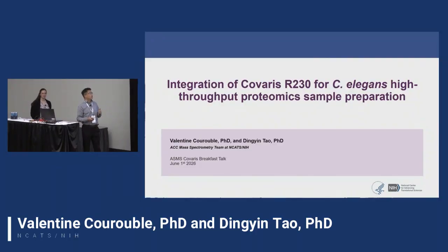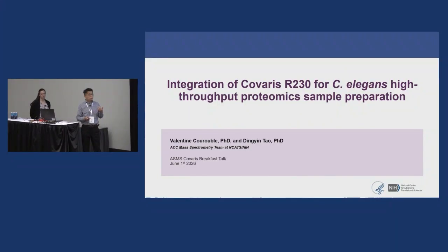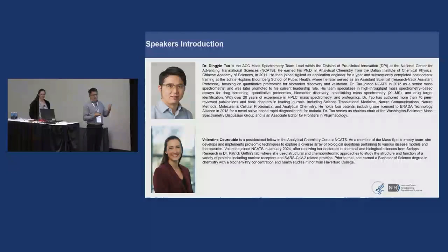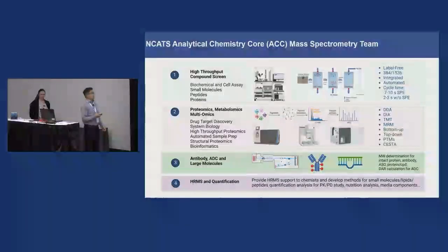So we'll talk about how we use the R230 system for C. elegans high-throughput proteomics sample preparation. Here is just a disclaimer and also a COI statement. And I think Samir already covered this.